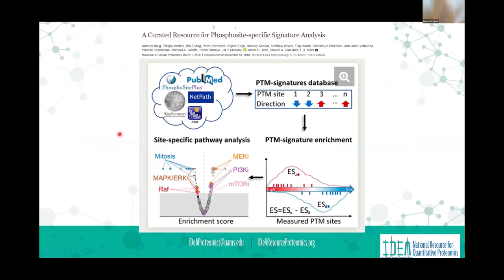Sure. Would it be similar, for example, to an ELISA for phospho, where we normalize to the total, non-phosphorylated, to see the relative abundance? Is it possible with this approach? Yeah, so it's all normalized. It's normalized to the total protein. Yeah, it's not phosphorylated for.